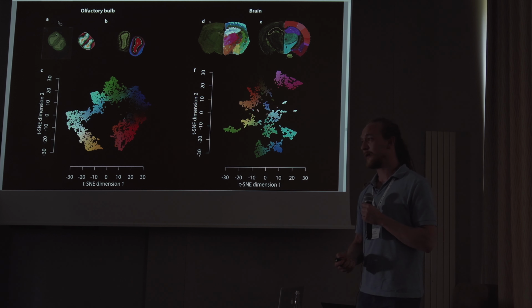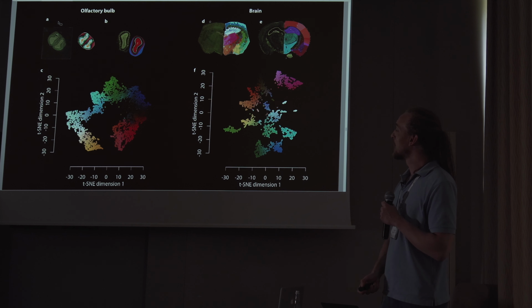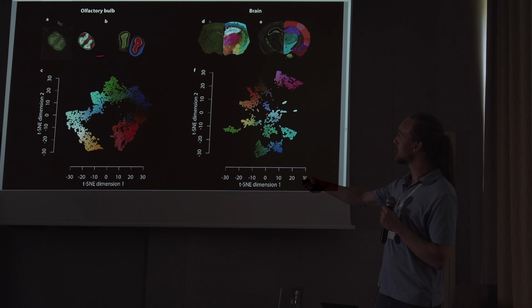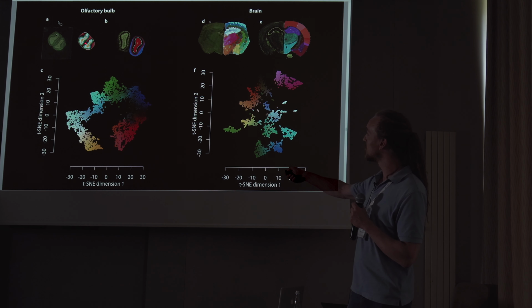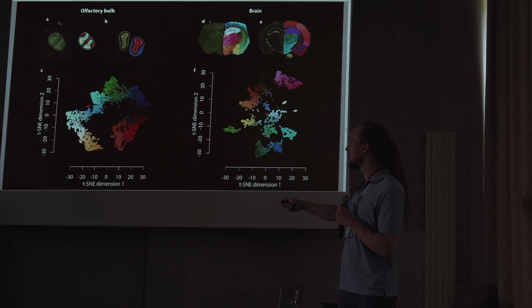Because everybody likes t-SNE scatter plots, I had to create some as well. I'm not really 100% sure what the upshot here is. Definitely what we see is that, so notice that the colors are matched here. So this you saw before on the preceding slides, and you also saw this before on the preceding slides. And so we have here a color gradient from yellow to light blue to green, dark blue, red, from the inside to outside. And it looks like we have a continuous manifold, or continuous sampling of the manifold here.